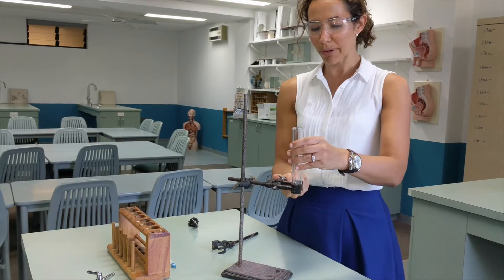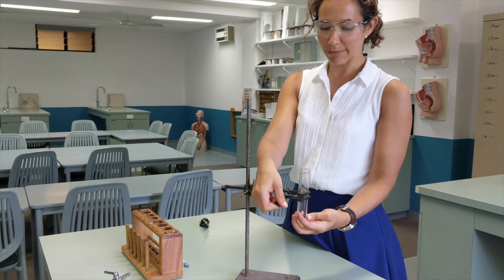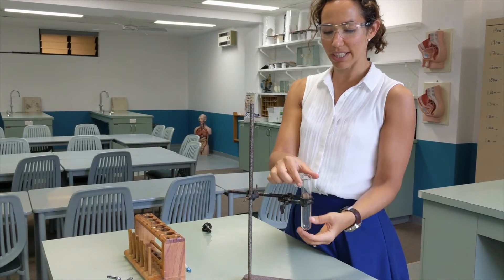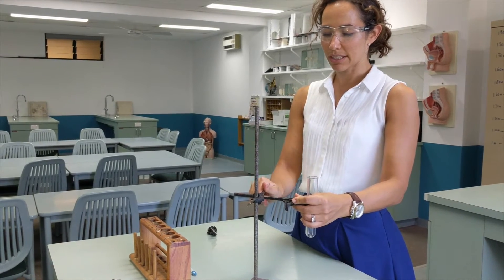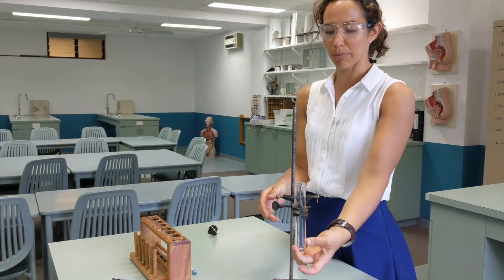Take your first piece of equipment — here's a test tube. Put the test tube where you need it to go, and then tighten the clamp so that it's held still, but don't tighten it so hard that you end up breaking the glass.